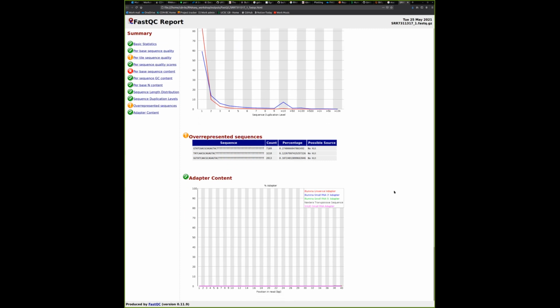All right, the last to metric, this tab that says overrepresented sequences, basically tells you the top few sequences which are found again and again in your sequencing, and it actually found this sequence about 7,000 times, 3,000 times, 2,000. I checked this. You can actually input the sequence and copy it into UCSC or BLAST to see where it maps to, because it's not so many sequences.